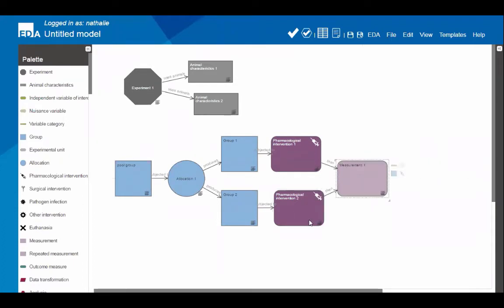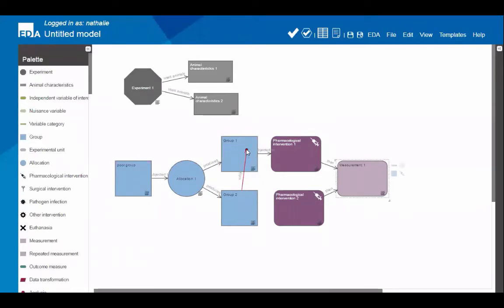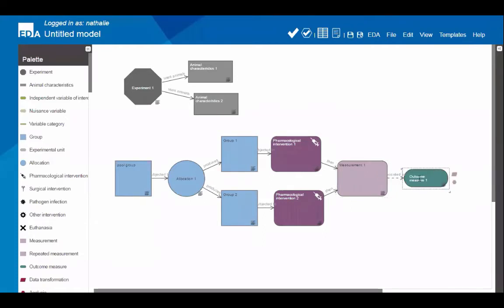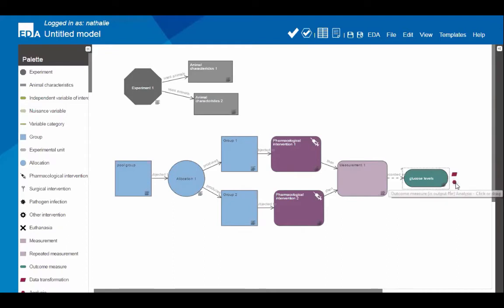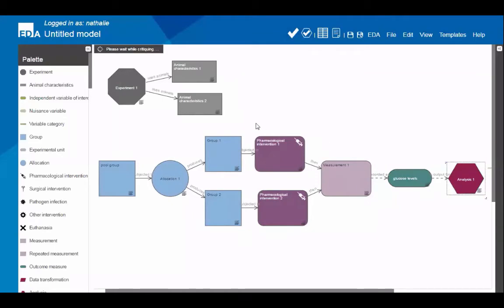After the measurement, the outcome is recorded as an outcome measure — plasma glucose levels. Then the data is analysed, so I add an analysis node. I'll leave it here and critique it to see what sort of feedback the system gives. You can collapse the palette for more canvas space and zoom to fit the model. After clicking critique, we get results — feedback comes in the shape of icons: red arrows for errors and yellow triangles for warnings, with blue circles for advice.